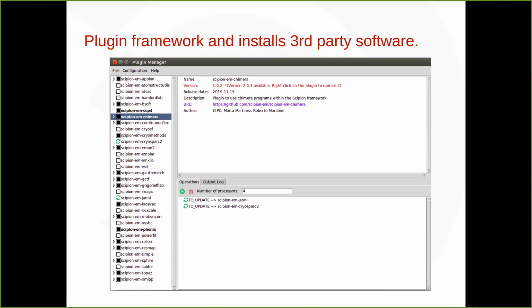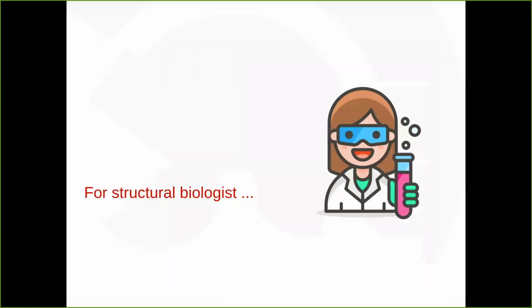So this model has proven to work. We released Scipion 2.0 with a bunch of plugins, and after releasing it, I think 5 or 6 plugins have appeared. We didn't have to change Scipion at all. So the plugin architecture model is already working fine.